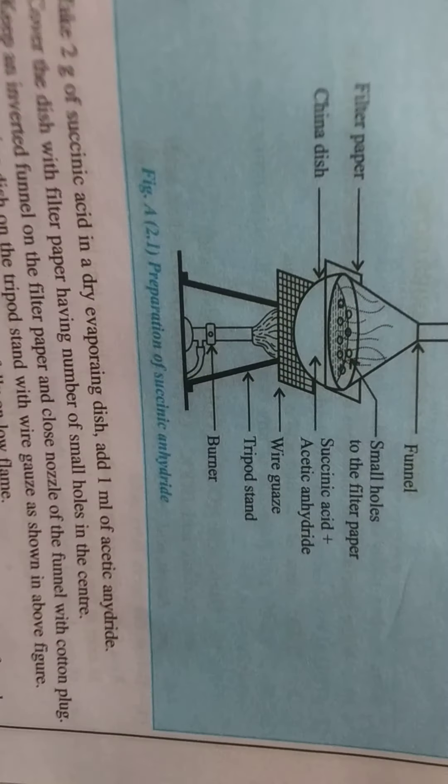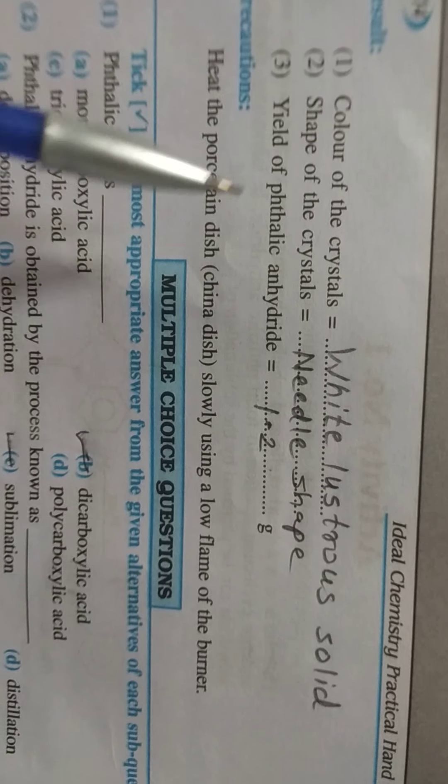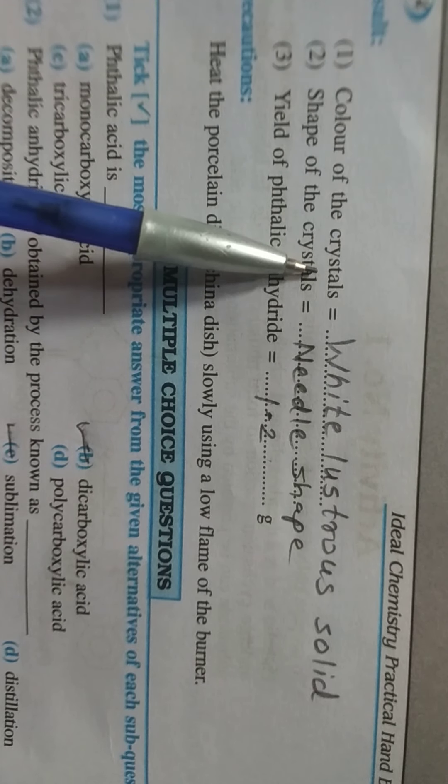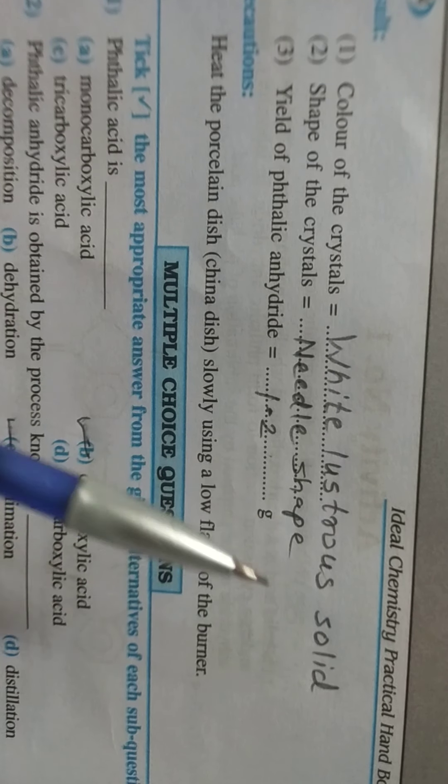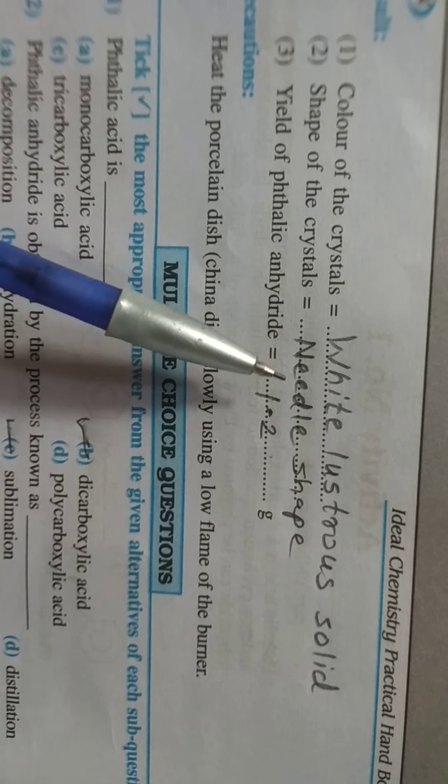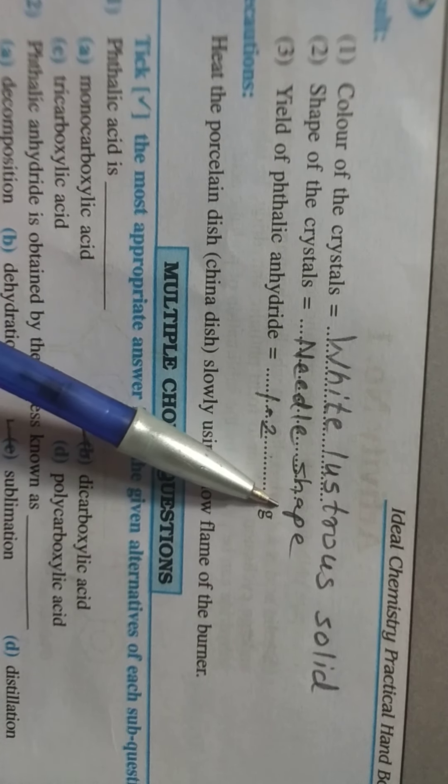Friends, now we write the result. Color of the crystal we obtain is white lustrous solid. Shape of the crystal is needle shape of phthalic anhydride.